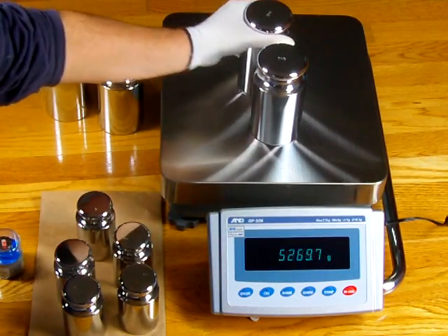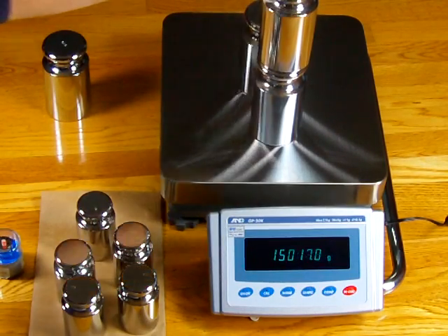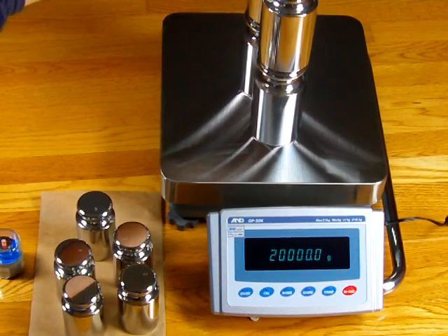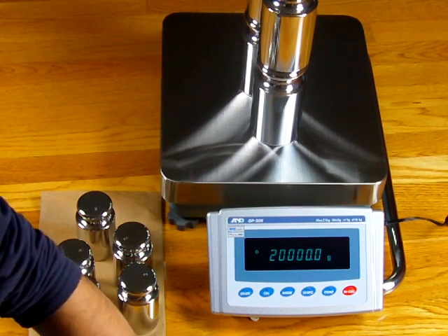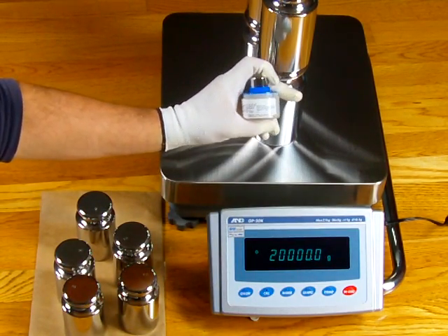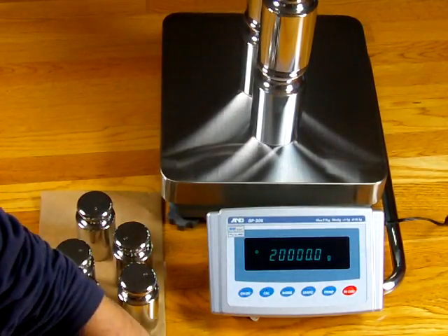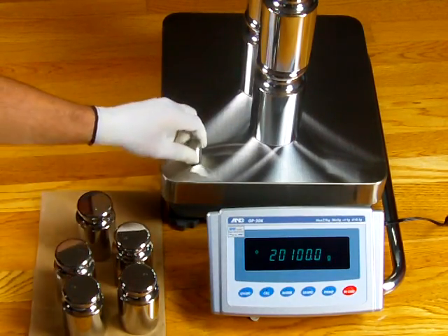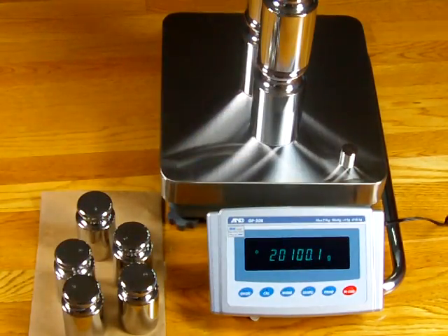These are 5 kilograms each. As I place the weights on the scale, I have four 5 kg weights on there. You can see the performance of this balance — it is right on the money. Now with this 100-gram ASTM Class 1 test mass, when I put it in the corners, the performance of the scale is spectacular.